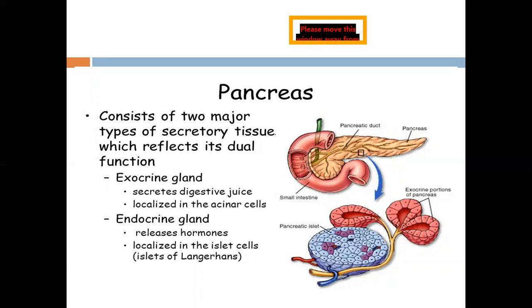It has a fine connective tissue capsule that forms septa. These septa, as usual, subdivide the gland into lobules.